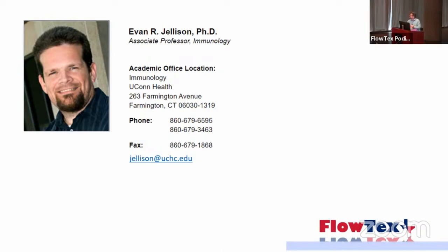Thank you. Regarding that, can you share your thoughts on how proteins from extracellular vesicles are cross-presented? So like EVs. Yeah. EVs we've been kind of ignoring. In one of my slides, we showed the low forward scatter and low side scatter stuff that we kind of ignore. But honestly, to me, I think EVs are the envelopes of the immune system of the body. And so what does an EV have on it? It has an address and it has something inside. In my opinion, this is how cells are signaling to each other over long distances. We used to call these hormones and things like that, but realistically, I think most things are probably going to be associated with EVs, rather than just free floating. I'm actually even wondering now if these chemokines and cytokines that I'm telling you about are all EV associated, and we just haven't really looked hard enough.